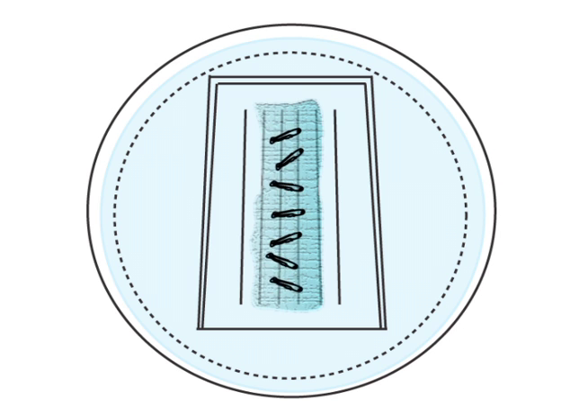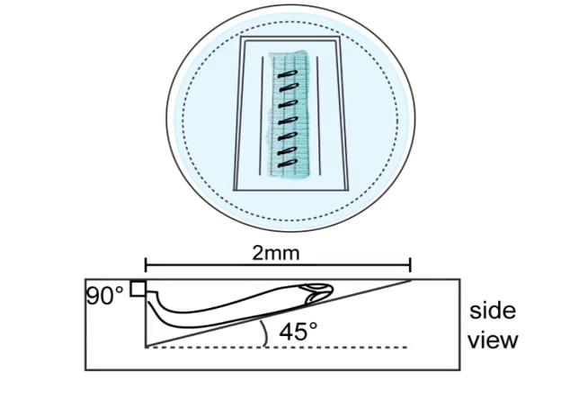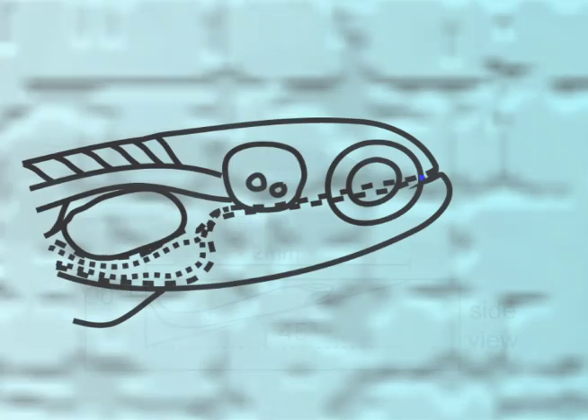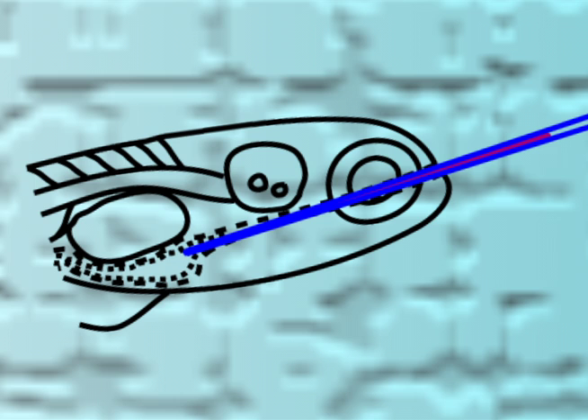The larvae are gently submerged into the mould and aligned with the angle of the gavage needle and micromanipulator. The needle is then inserted into a larva's mouth and manoeuvred into the intestinal bulb. Once in place, the material is released into the lumen.